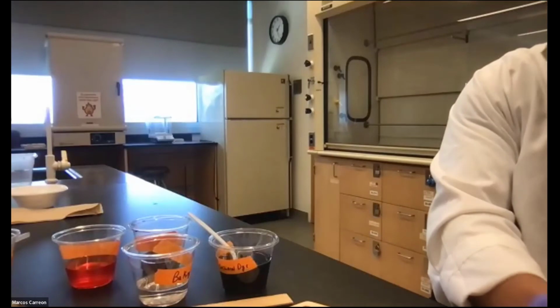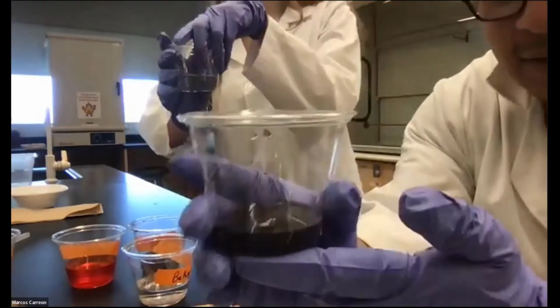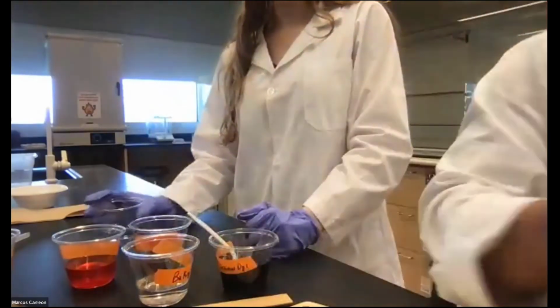All right, so you want to do it again? All right, so we're gonna do it again. Let's see. Should we add a little bit more water to see it a little bit better?